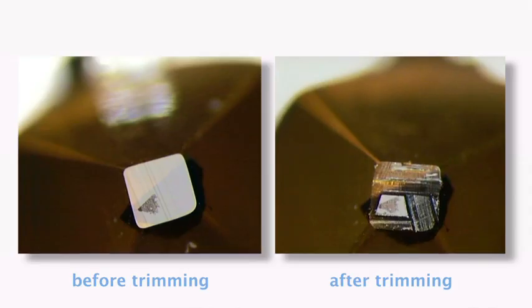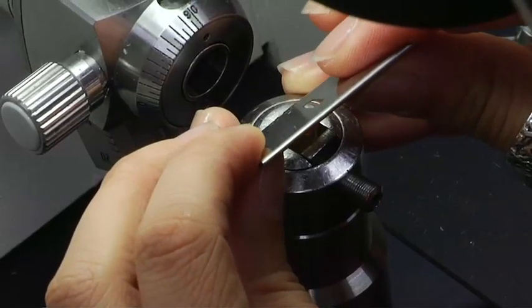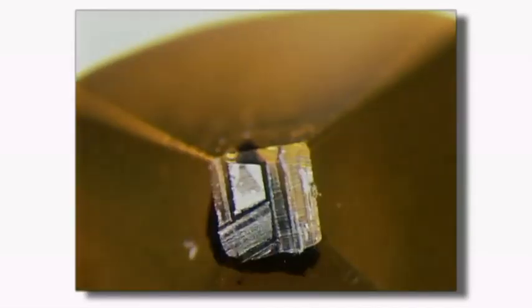Trimming is a process of removing excess resin surrounding the sample and sculpting the block face so that sections form a ribbon when coming off the knife. The block is then trimmed to a trapezoid shape with a razor blade for semi-thin sectioning.